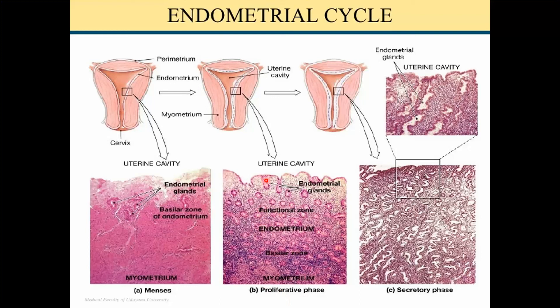In the secretory phase the glands are dilated and filled with secretion. The blood vessels are spiral and they reach to the superficial layer. You can see all three different types here — this is the menstrual phase with the degenerating endometrium.